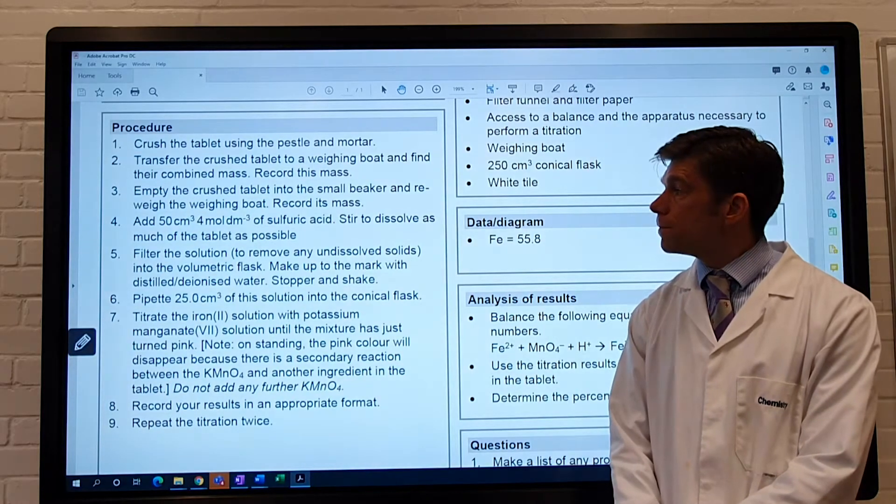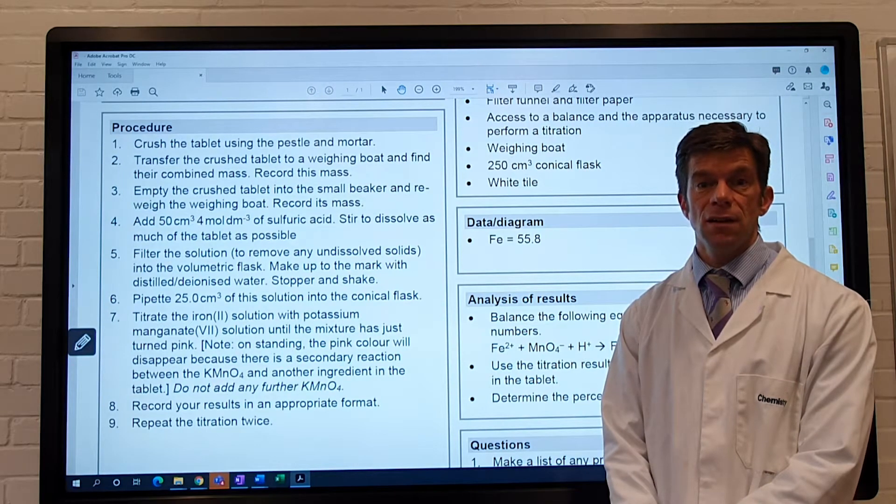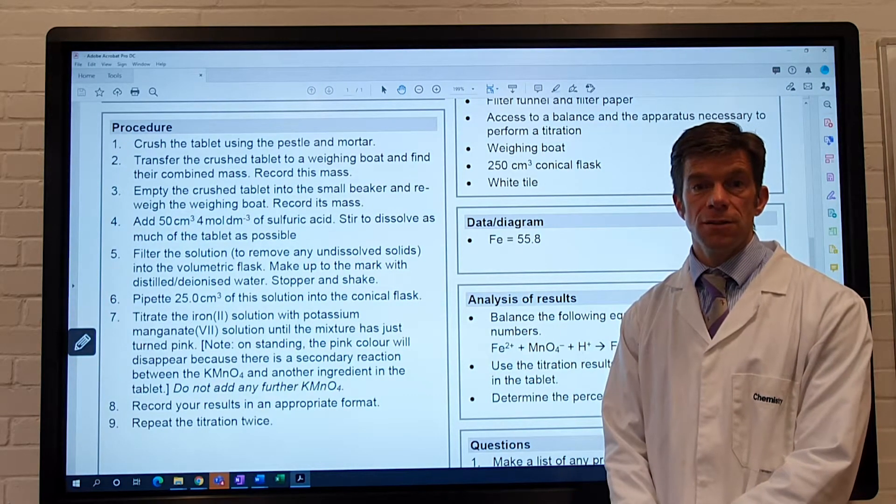Step 4, add 50 cm³ of 4 mole per dm³ sulphuric acid, stir to dissolve as much of the tablet as possible.